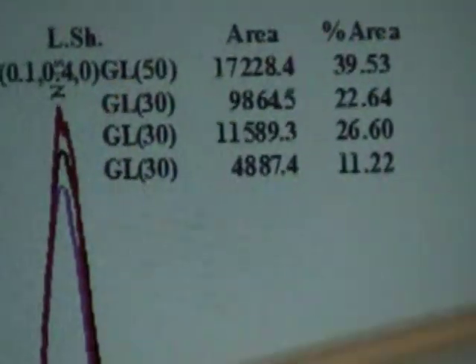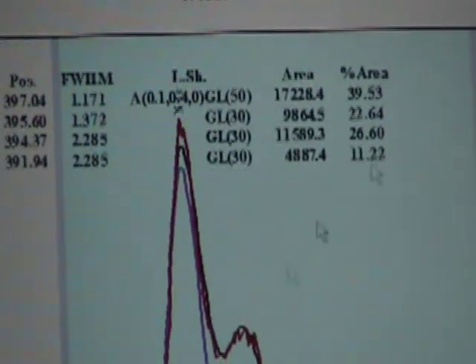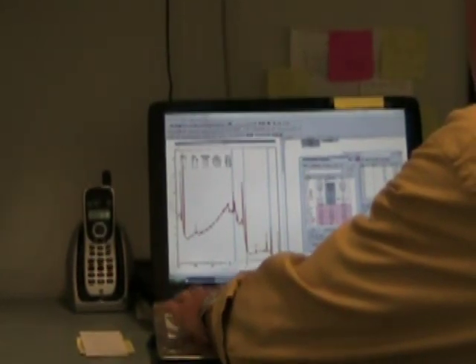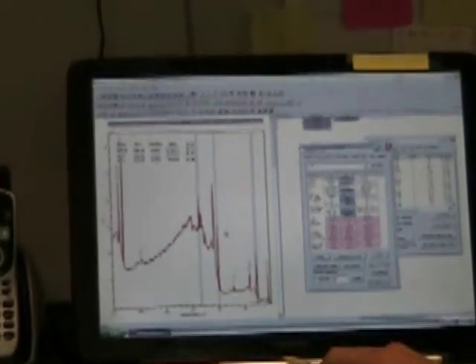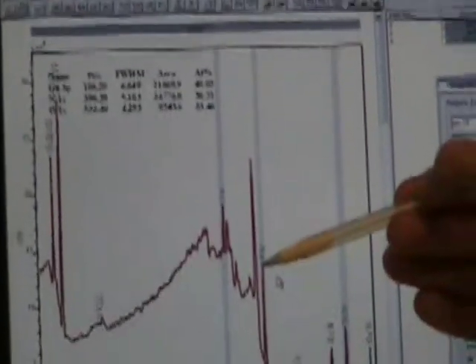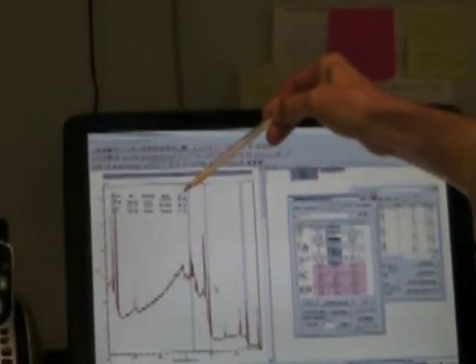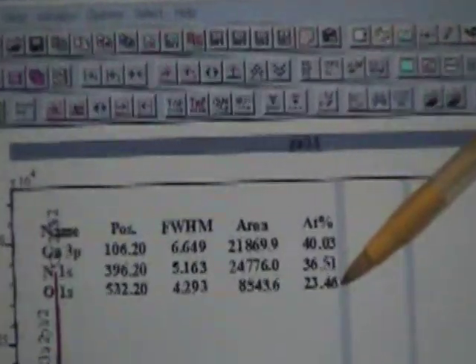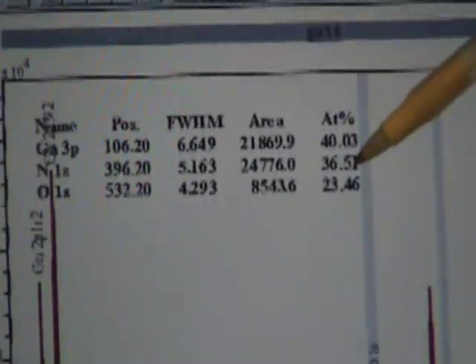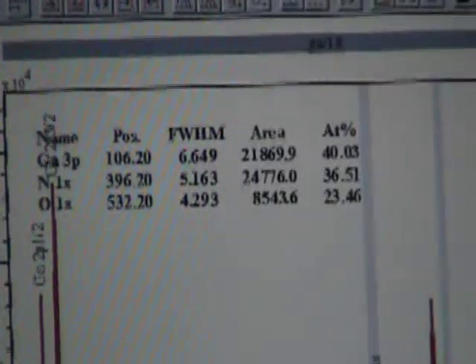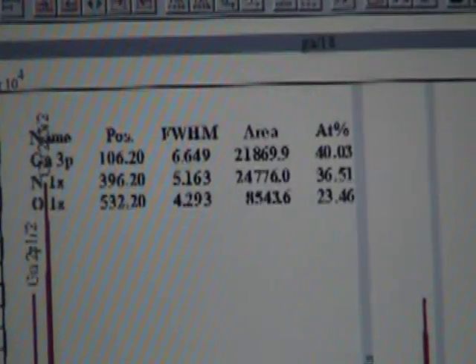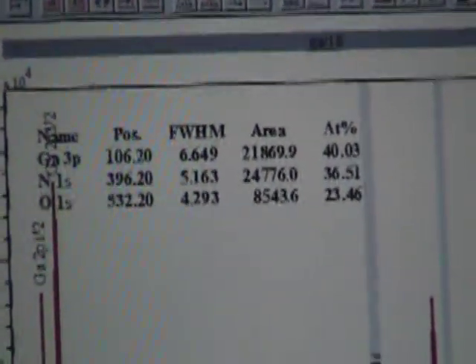And what we see is only 39.5%, or about 40%, of this overall envelope is actually nitrogen. So with that understanding now, we can go back to our survey scan and input that number and recalculate the surface concentration with the understanding that this guy is only 40% nitrogen. Input that value and recalculating the surface concentration, taking into account that this is not all nitrogen. We now have 40% gallium, 36.5% nitrogen, and 23% oxygen. So we have 40 gallium atoms and 36.5 nitrogen. That's much closer to what we expect for gallium nitride.